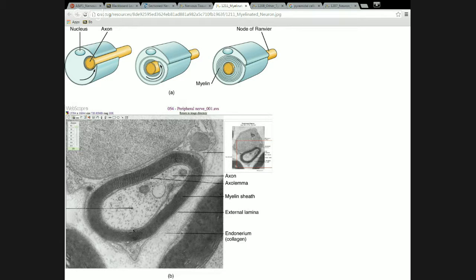Now, I'm not positive, but I think this might be a cell nucleus, but I'm a little surprised. It looks pretty big for a nucleus. I'm not quite sure what it is.